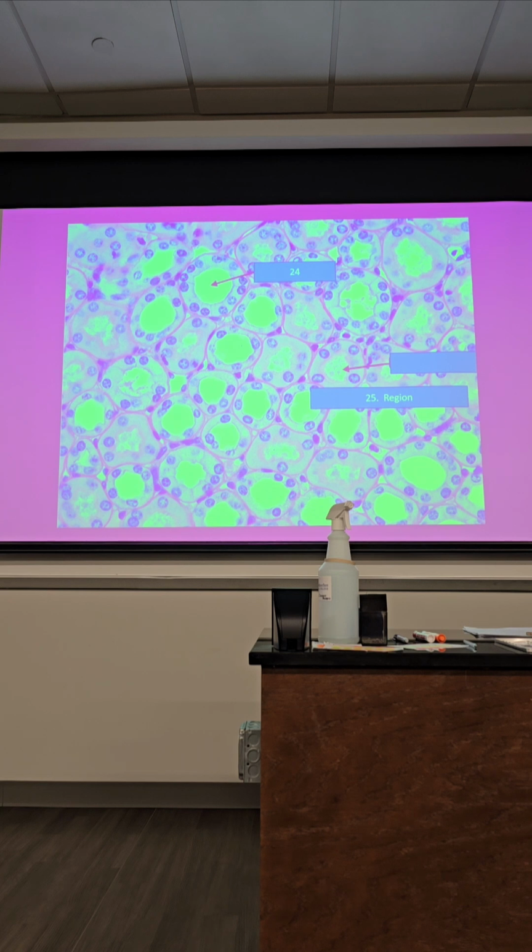If you were seeing the glomerulus and so forth, then we're gonna call that the cortex. The kidney has a cortex and a medulla. But most of the tubules are within the medulla, and the actual renal corpuscle is usually present within the cortex.